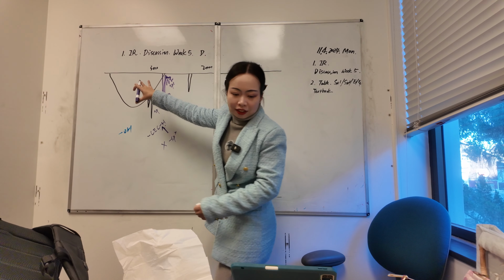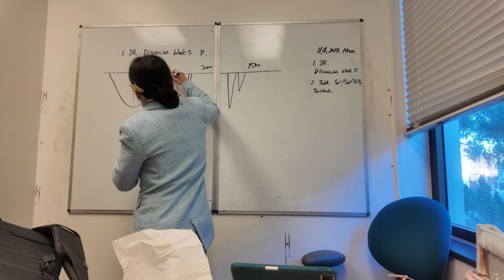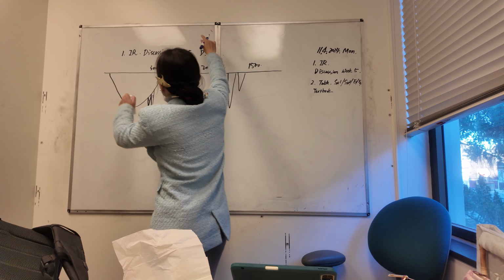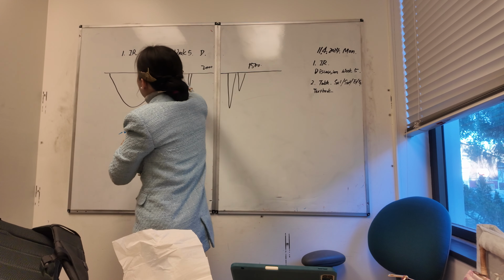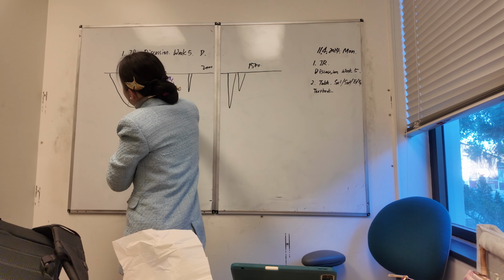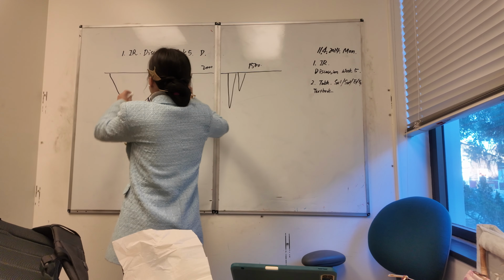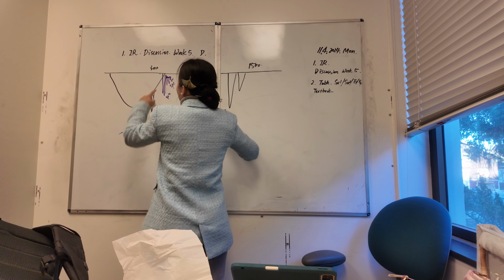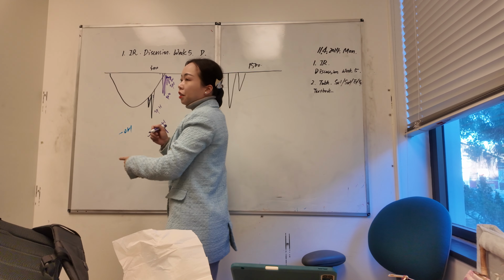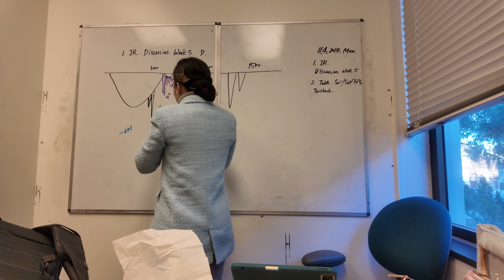Okay, I actually wrote the things wrong. I misunderstood this part. I actually was not doing compound D. If I draw 3000 here, this is how you differentiate. If it's after 3000 and it's sharp and deep, that's sp, which is not the one that I was working on.